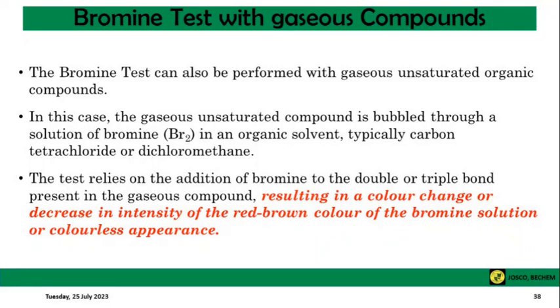Now let us look at the bromine test with the third nature of compound, the gaseous compound. Let's ask ourselves, if the compound is in the gaseous form, how will we be able to add bromine to it? Do you have any idea? Okay, now let us look at the concept behind this.